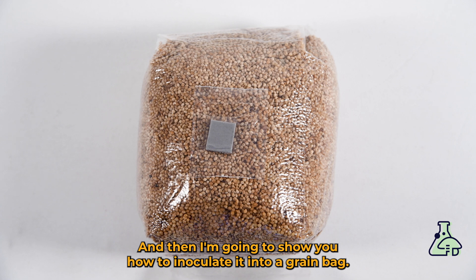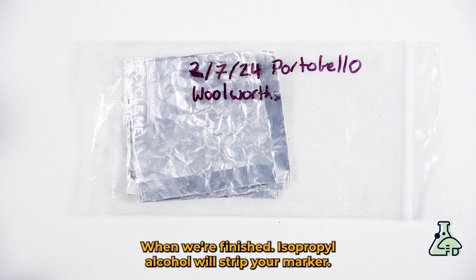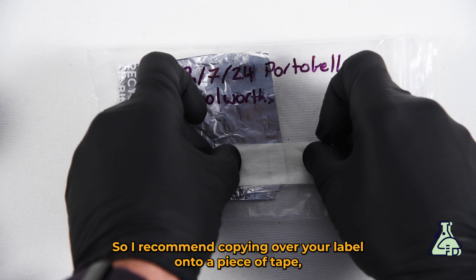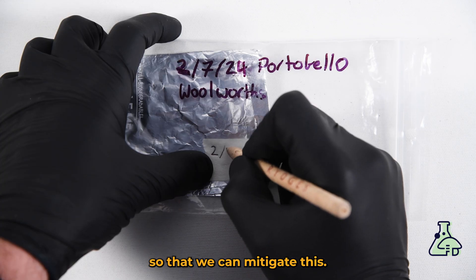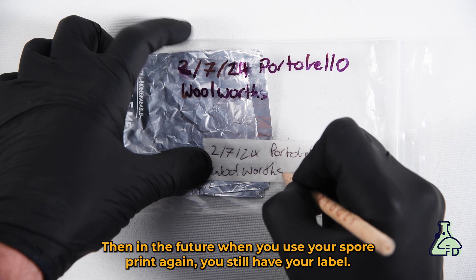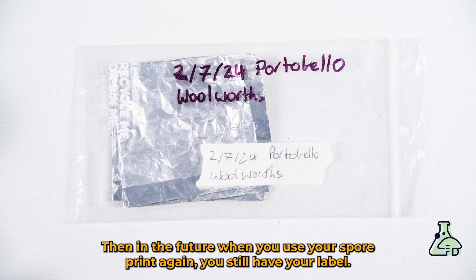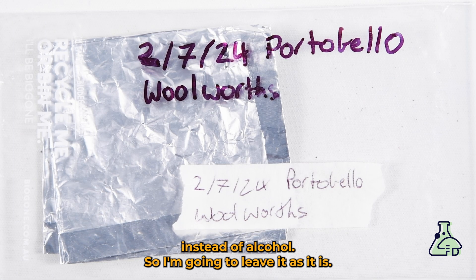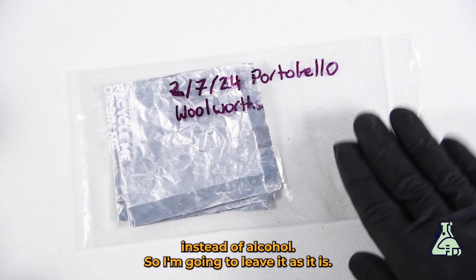It's also always good to wear a mask while we're doing this, and a pair of gloves. I'll also show you how to inoculate into a grain bag when we've finished. Isopropyl alcohol will strip your marker, so I recommend copying your label onto a piece of tape to mitigate this, so that in the future when you use your spore print again you still have your label.